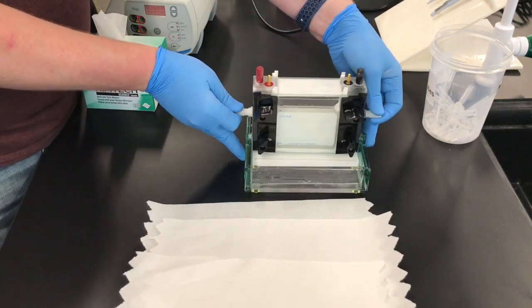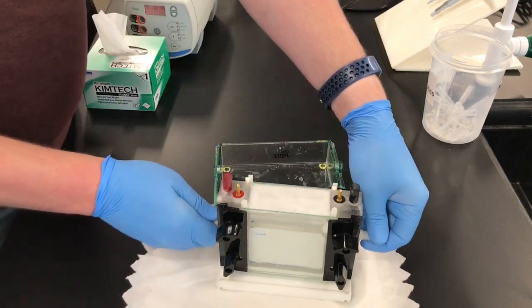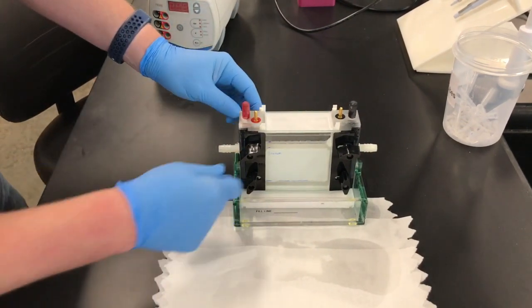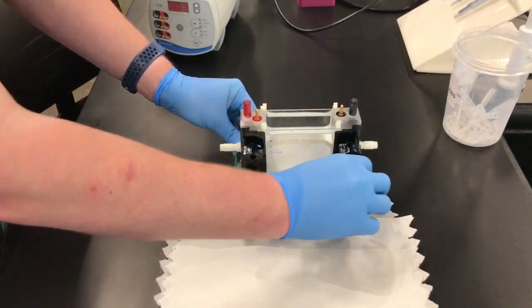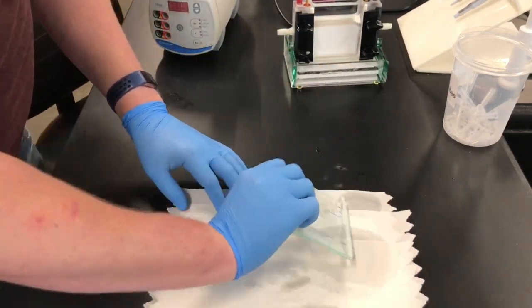Get some paper towels because this next part will be messy. Remove the apparatus and dump out the buffer in the bottom chamber. Put the apparatus back into the bottom chamber. Loosen the gel by loosening the clamps and then the buffer in the middle chamber is all going to flow out. Take out the gel and set aside.